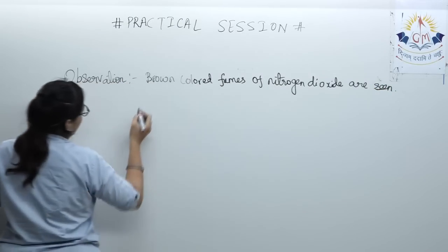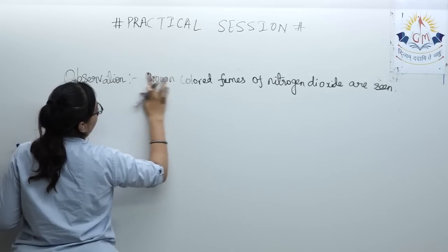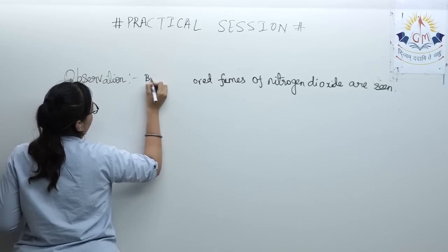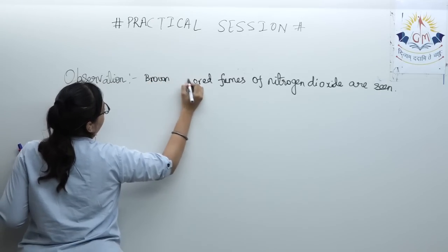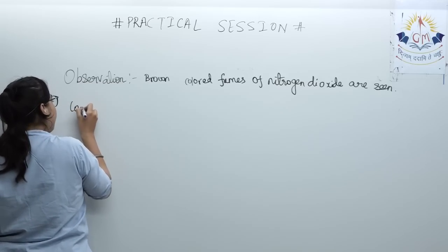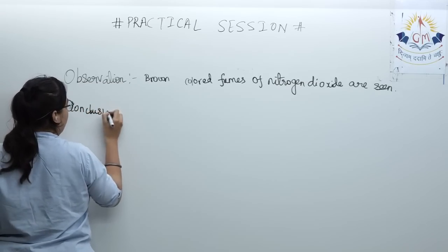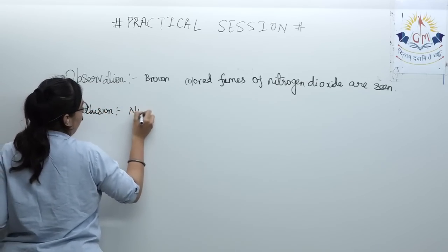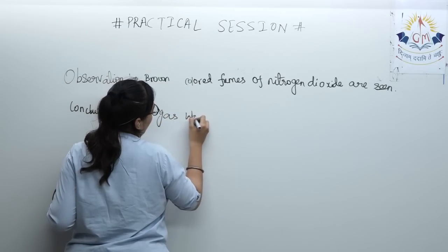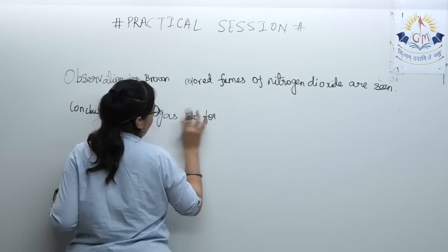Coming to conclusion. So this is how nitrogen dioxide gas was formed in laboratory.